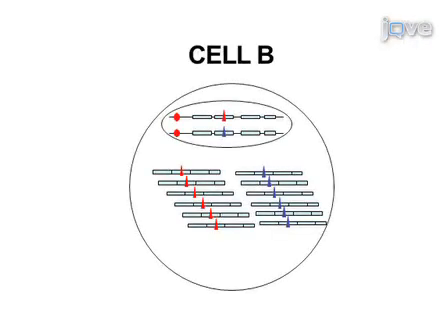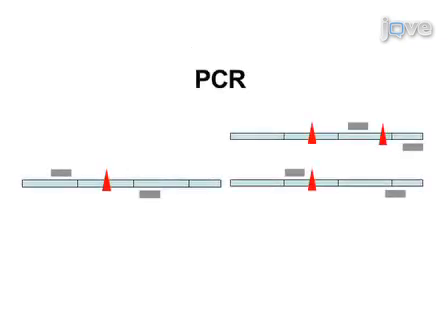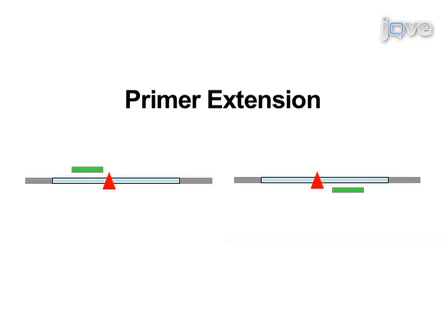The best control for the experiment is using a cell line heterozygous for the coding SNP, assayed for primer extension, but that does not carry the disease-associated allele. Additionally, design assays for alternative DNA transcribed coding markers. If these are not available, an additional control can be provided by alternative PCR primer pairs targeting different exons. For the primer extension assay, an internal control can be provided by the design of extension primers annealing to both forward and reverse strands.